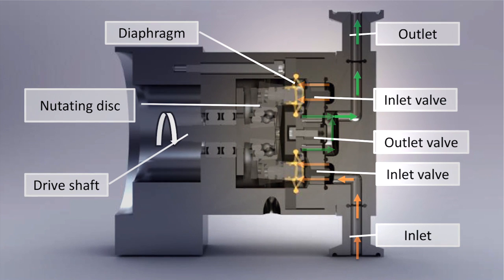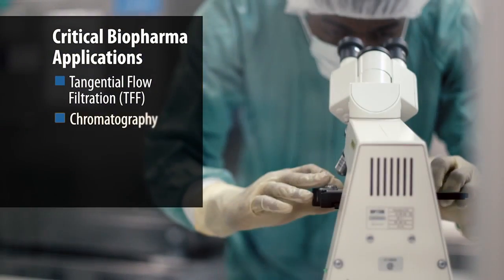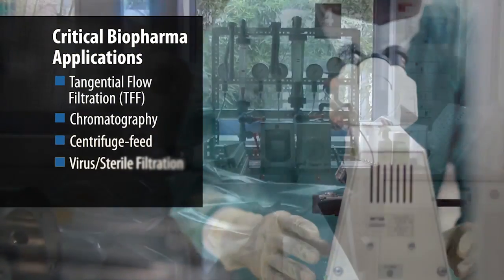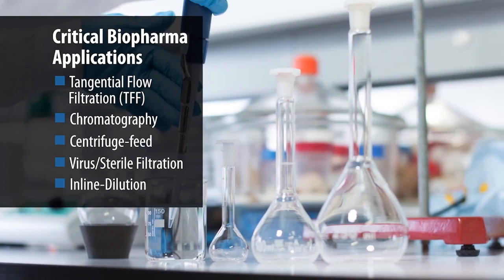In fact, this is superior to a human heart because there is low pulsation with a high turndown ratio. No other pump technology can provide the care, the sensitivity, the protection required of biologics in biopharmaceutical manufacturing applications.